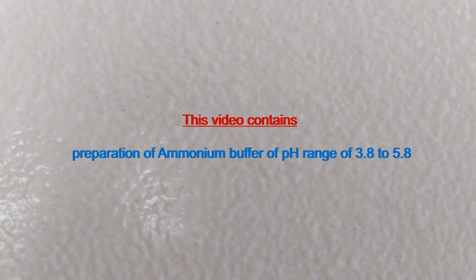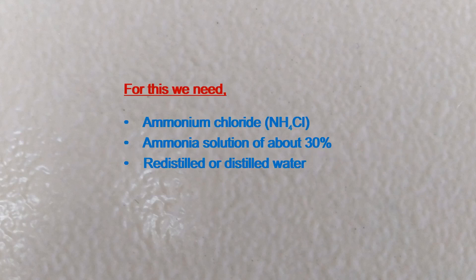This video contains preparation of ammonium buffer of pH range of 3.8 to 5.8. For this we need ammonium chloride, ammonia solution of about 30%, and re-distilled or distilled water.